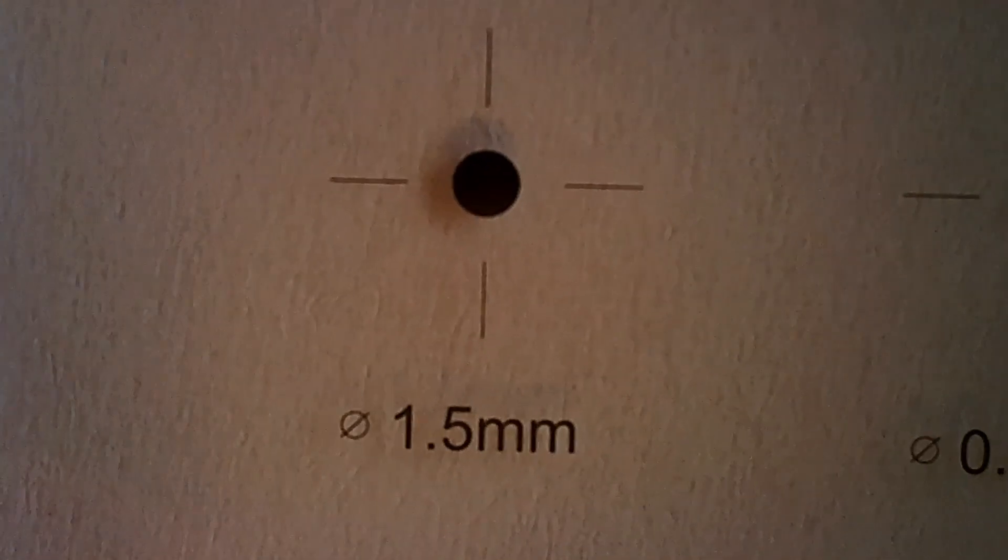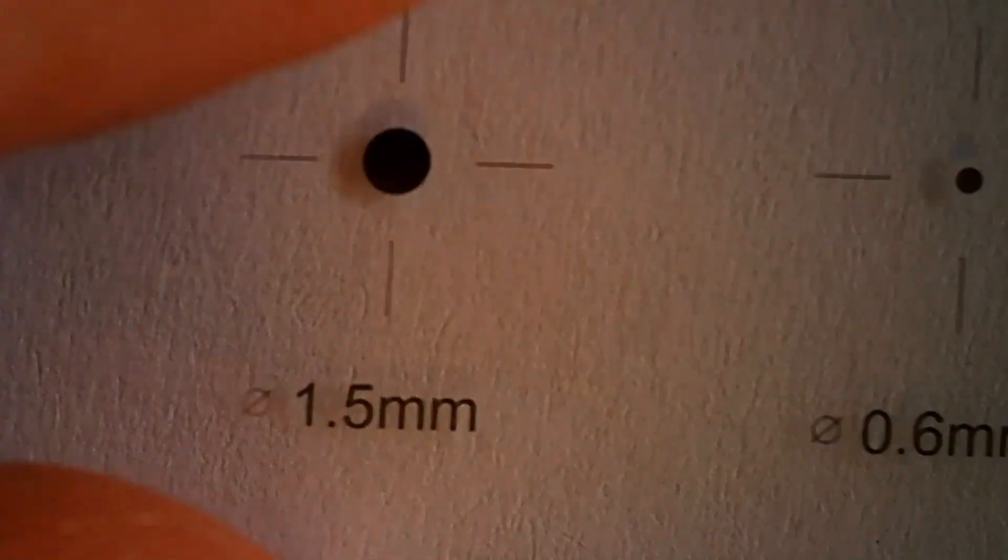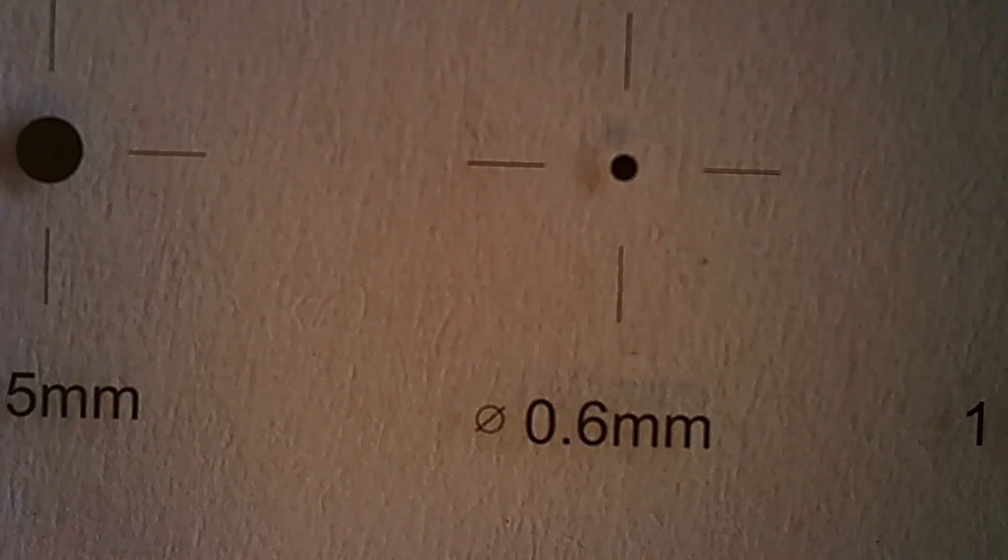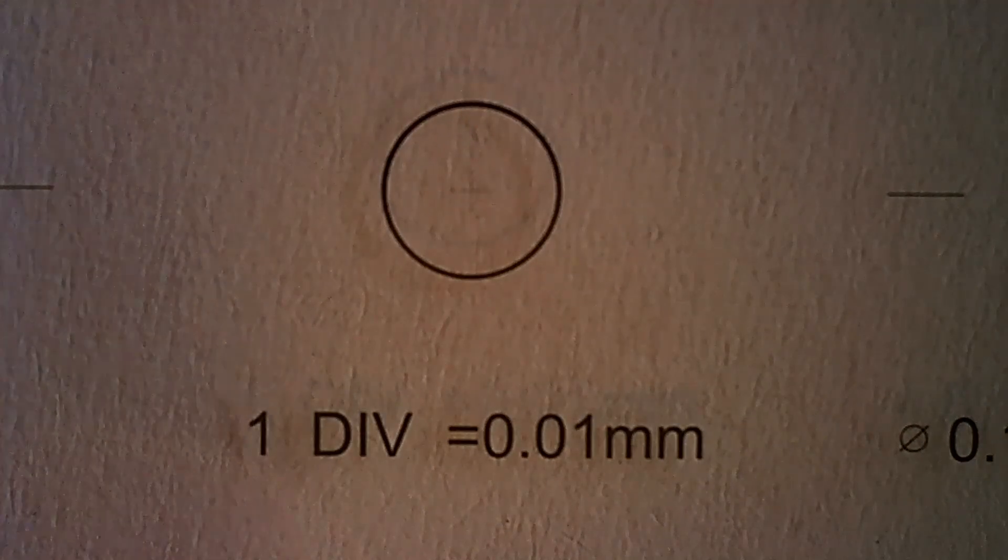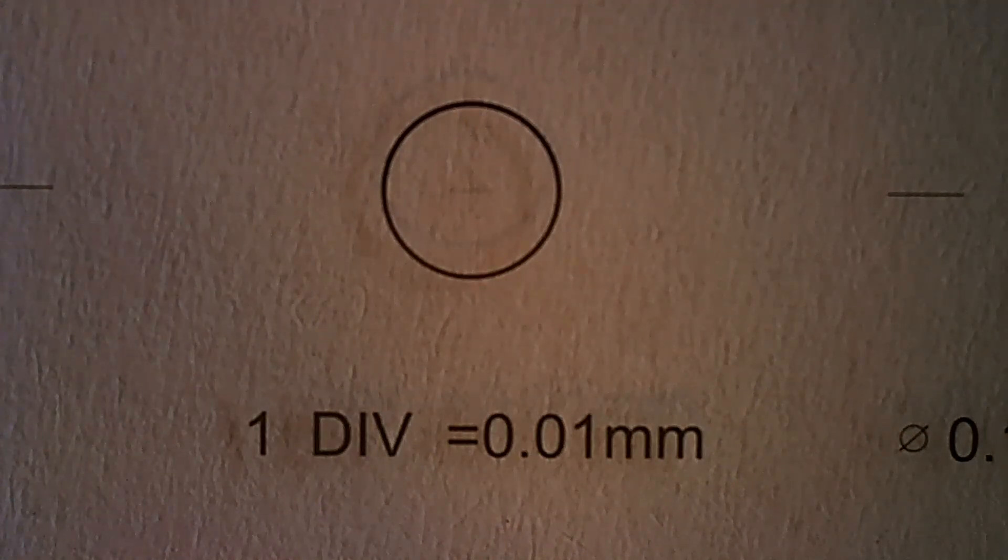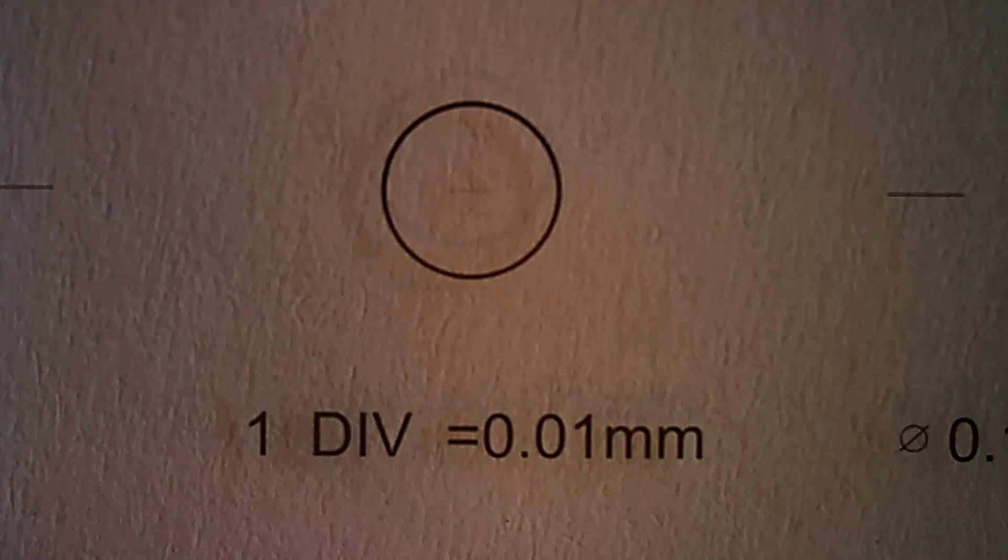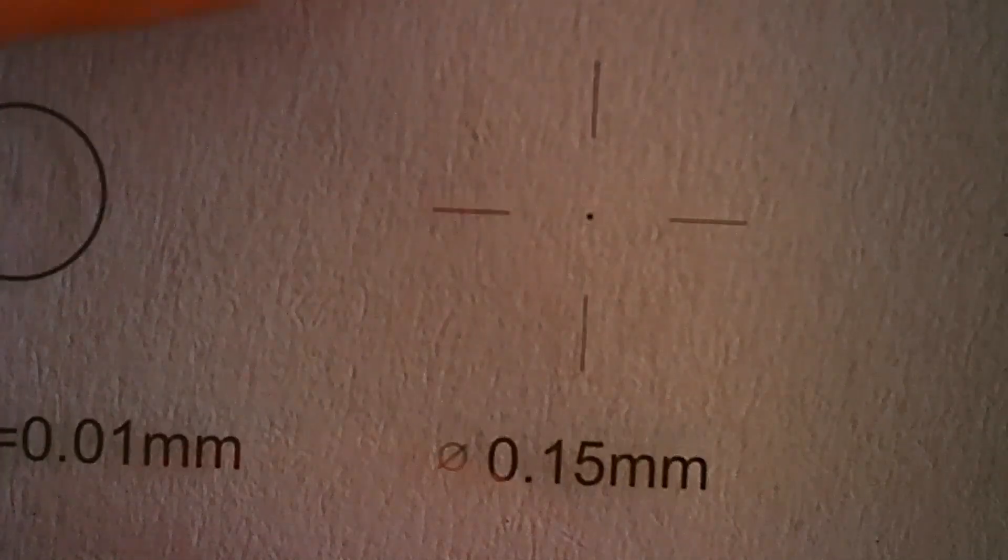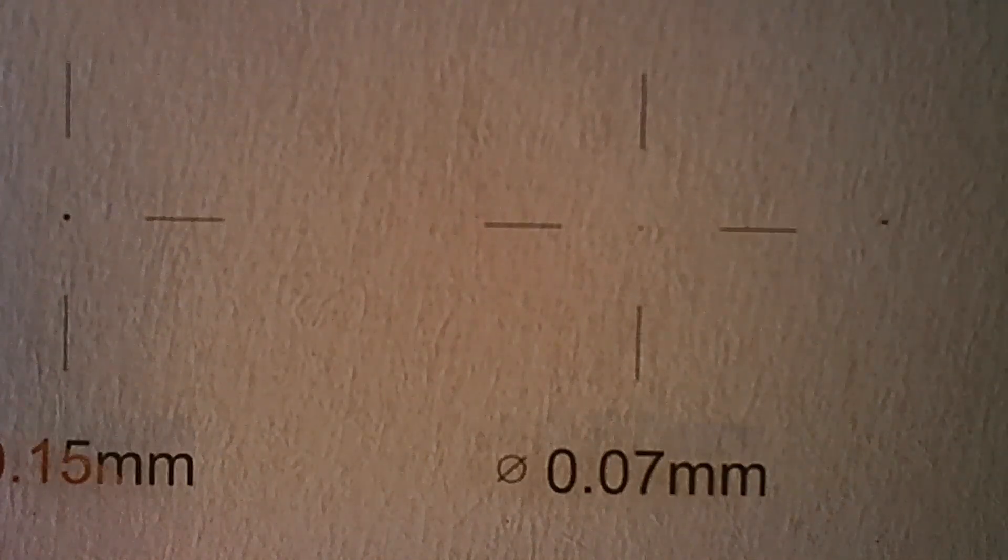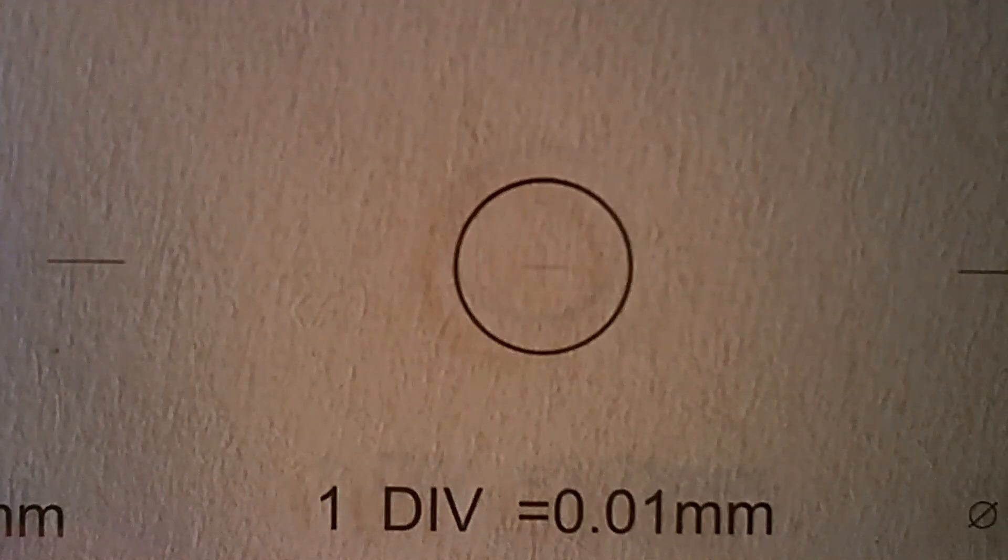So this is the 1.5 millimeter calibration point, this is 0.6 millimeters, and this is the ruler I will take a closer look later because even on this stage on this zoom I cannot see the ruler. This is 0.15 millimeter point and this is the 0.07.